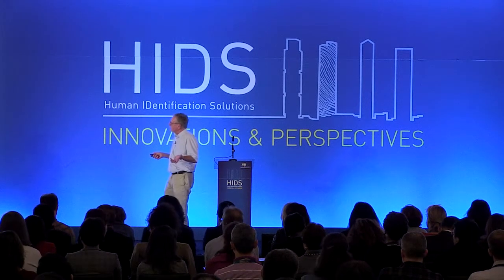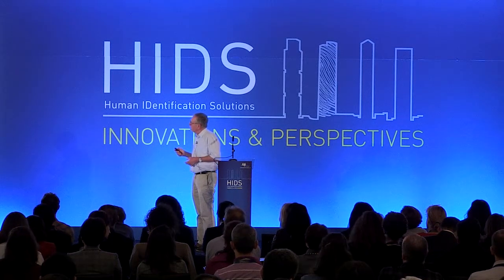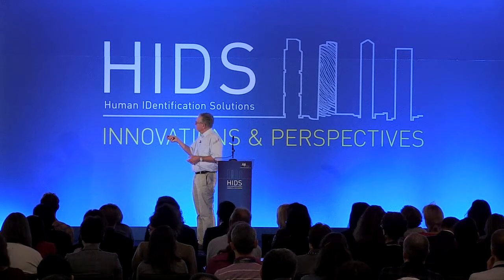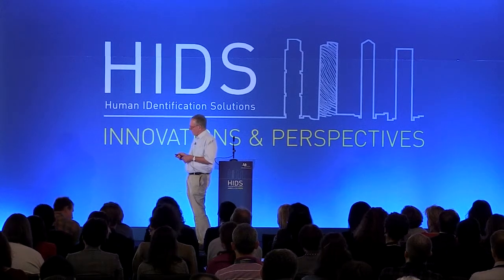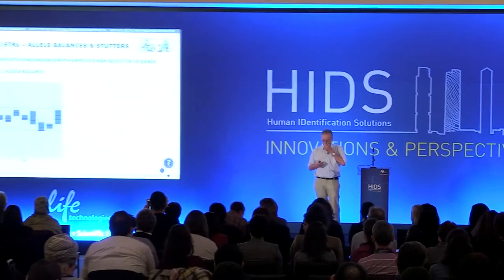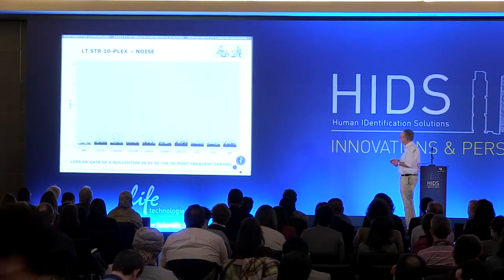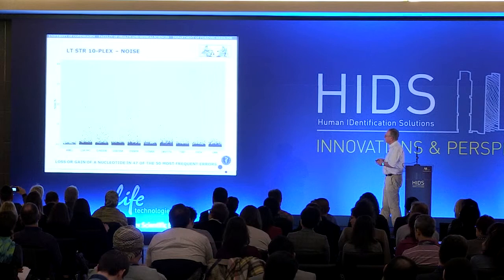And here you see the results as they come out of this plug-in that comes from Applied Biosystems. And we see the same phenomena as usual. These are the alleles, and there will be some stutters, and there should be, and there are some other artifacts. So it's the same picture as you were used to. What about noise? You can see a noise plot here, and it's not worse than what we see with STRs and capillary electrophoresis.